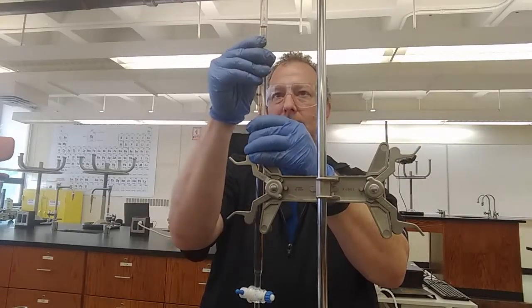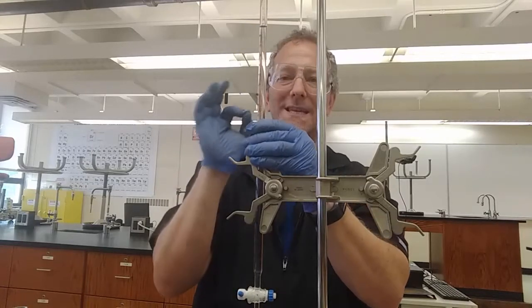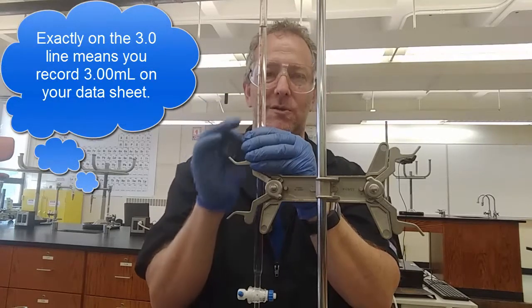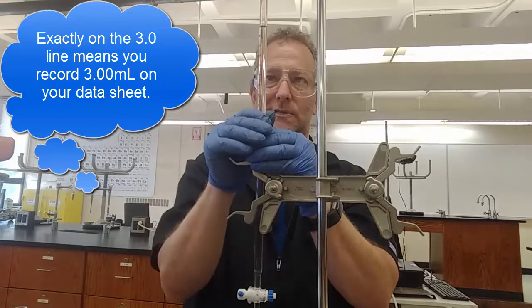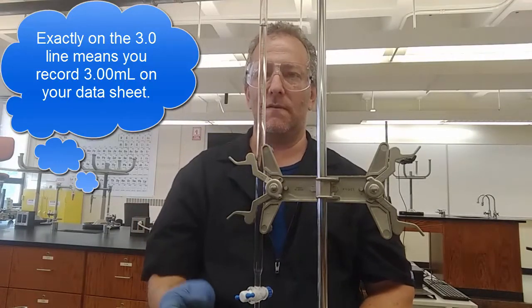And what that means is it's not 3.0 or 3.1. It's exactly on the 3.0. It's 3.00. Okay, I have to record that extra decimal place. It reads in tenths. I have to record to the hundredths. This is 3.00 milliliters is my starting value.